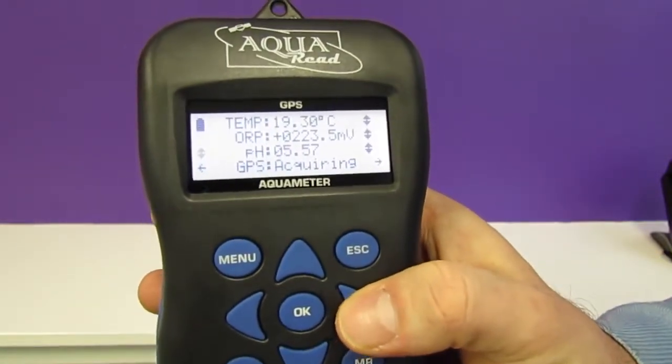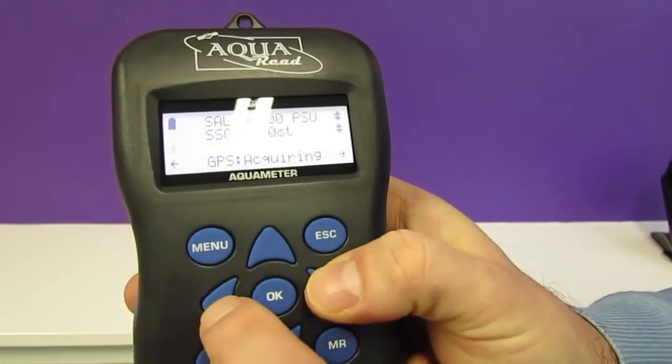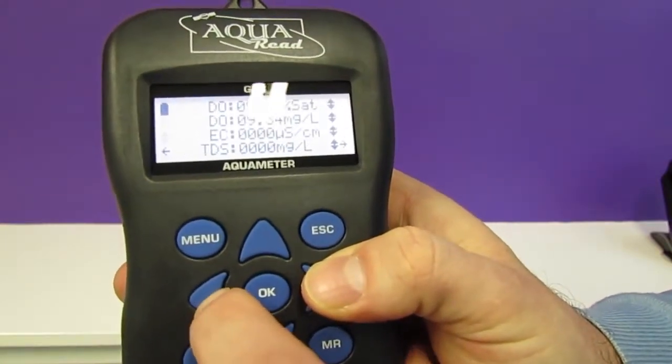You can scroll across on the screen using the left and right buttons to display all of the parameters that are currently being measured.